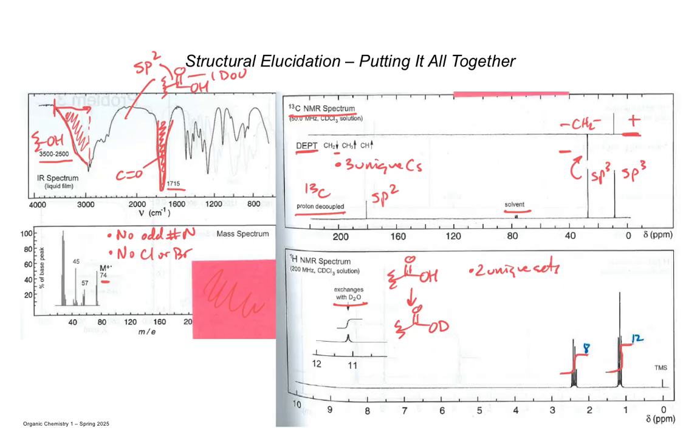All I did was take a ruler and measure the distance from the bottom to the top of that curve in millimeters, and I got 8 and 12. So we're going to use the information to set up a ratio. This is sort of like a Gen Chem problem. From that ratio, we're going to figure out the number of hydrogens that belong to that signal.